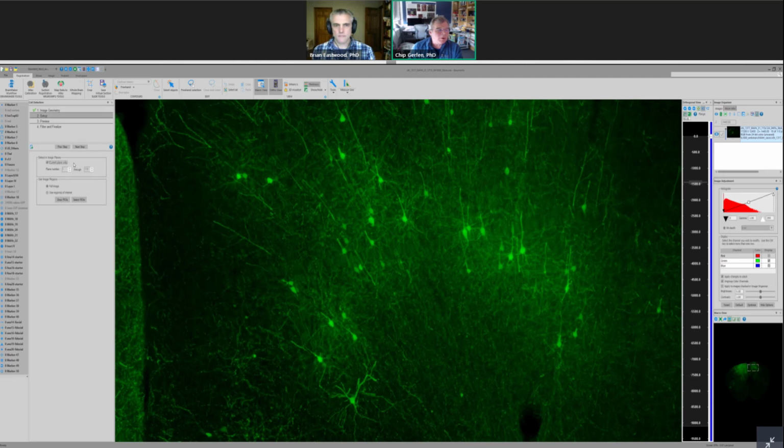At some point, I went through and had it apply cell detection parameters to every section through the brain. In this case there were 115 sections in this brain, and we could apply the parameters and do cell detection through the whole brain in one step, start it and then run it. For the purposes of demonstration, though, I'm just going to show you how we did it in individual planes. We also have the option to do cell detection in just part of the section by drawing a region of interest, but we typically do the whole section, so we're going to use the whole image. This is just setting up the steps. In this case, we're going to detect cells in the green channel.